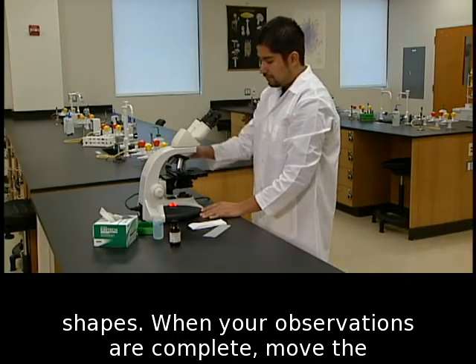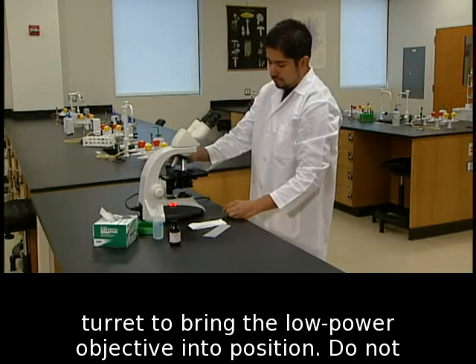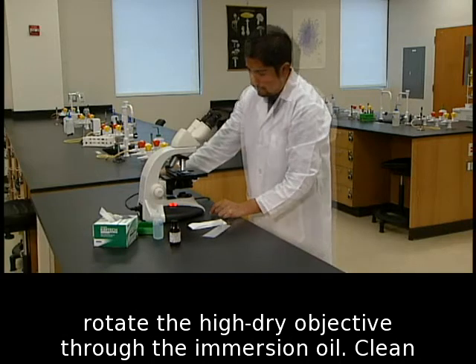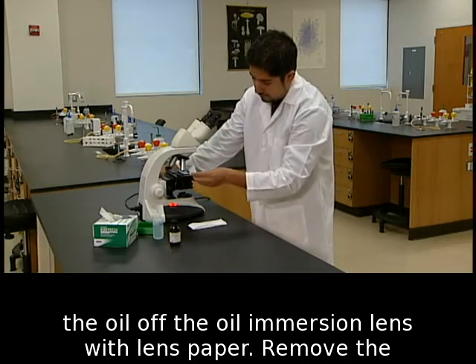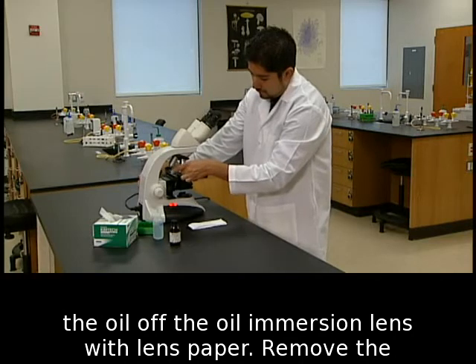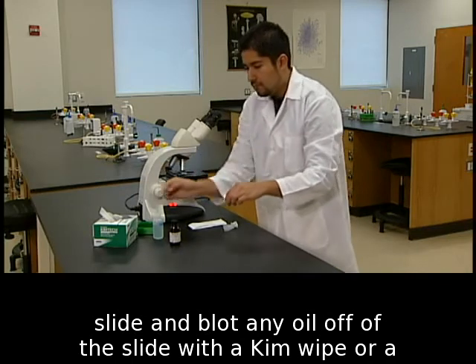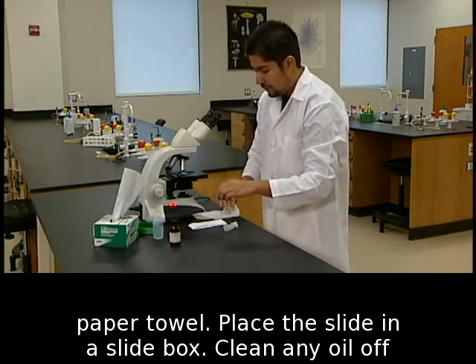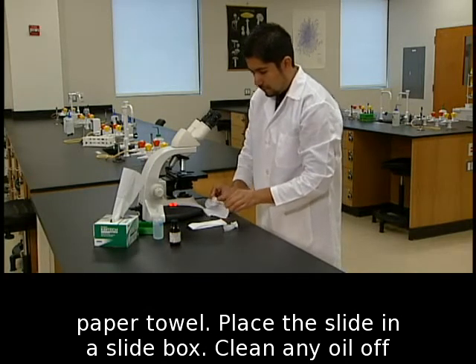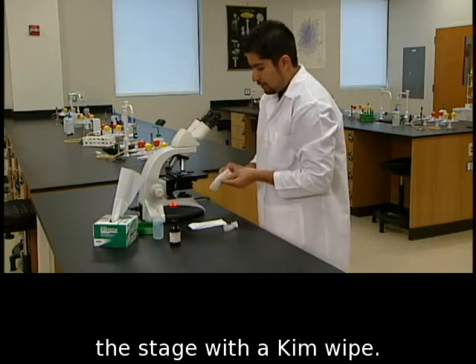When your observations are complete, move the turret to bring the low power objective into position. Do not rotate the high dry objective through the immersion oil. Clean the oil off the oil immersion lens with lens paper. Remove the slide and blot any oil off of the slide with a Kim wipe or a paper towel. Place the slide in a slide box. Clean any oil off the stage with a Kim wipe.